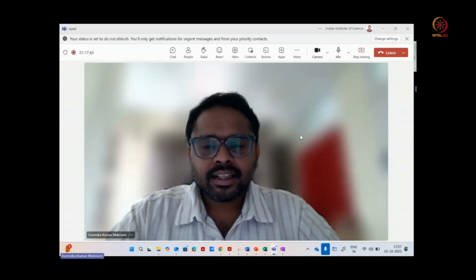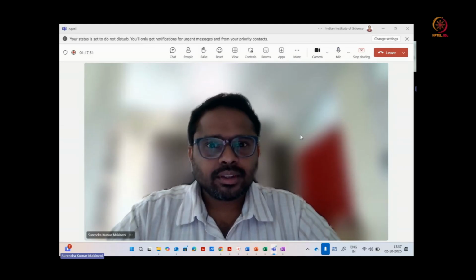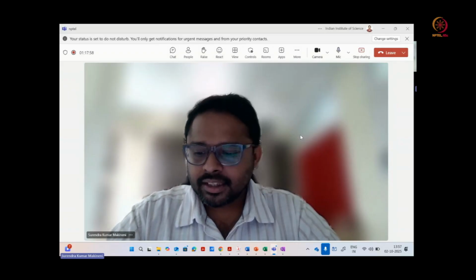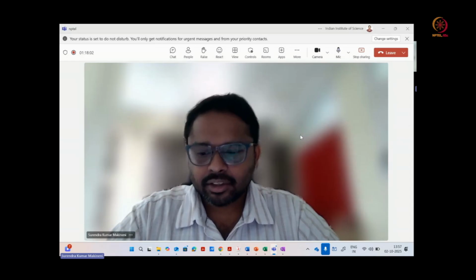Welcome to this class. In the last class, we discussed the scanning electron microscope, the column, and also the scanning electron image and the backscattered electron image. Now we will discuss the detection of these secondary electrons and the backscattered electrons.